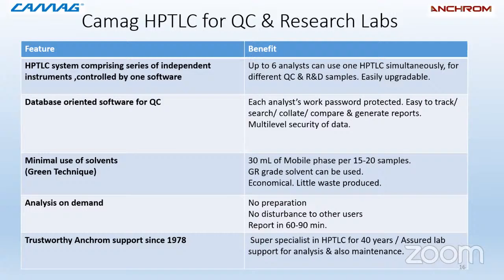You can apply any sample, any organic non-volatile sample, on the plate, and you can directly put it for application or further analysis. Even though you do not have any information about your sample, it is not going to damage your system or anything else.